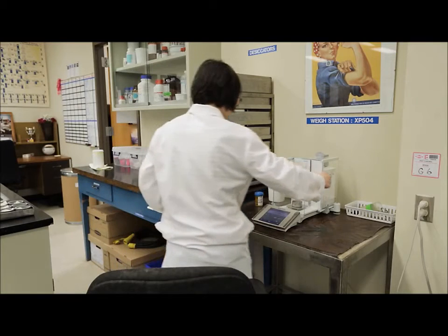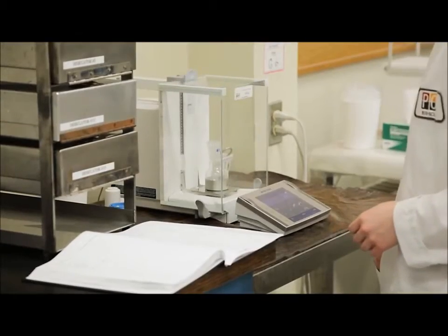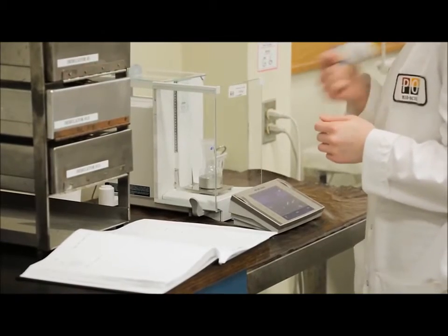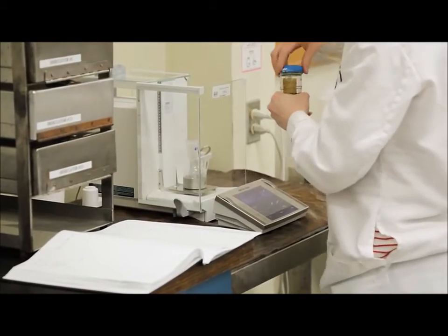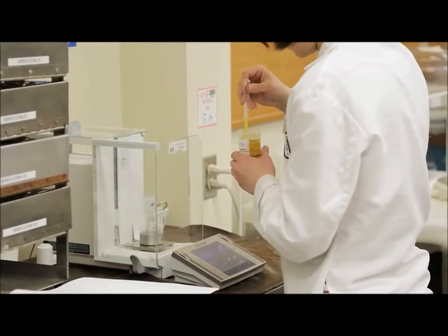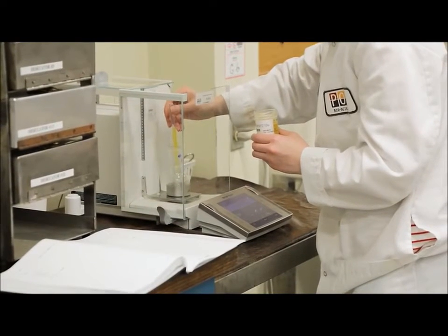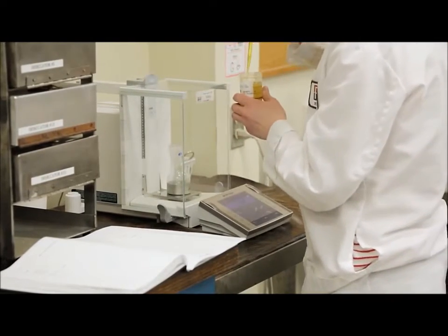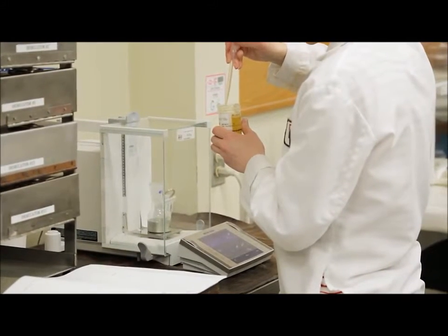When starting the fatty acid composition analysis, the first thing we do is subsample our sample and weigh it into a round bottom boiling flask. It is critical at this point that the sample is mixed well, because you want to be subsampling from a sample that is homogeneous and uniform throughout. We weigh approximately 0.1 grams into the round bottom boiling flask, and this sample weight is recorded.